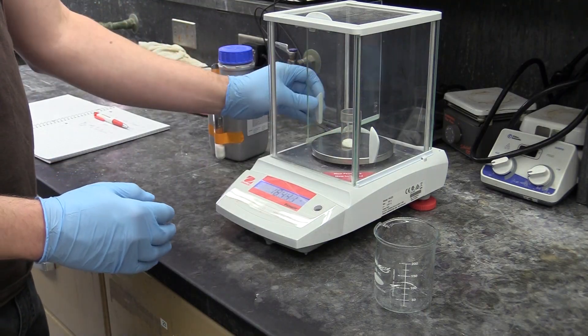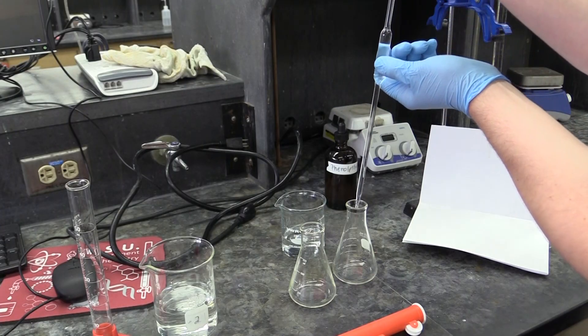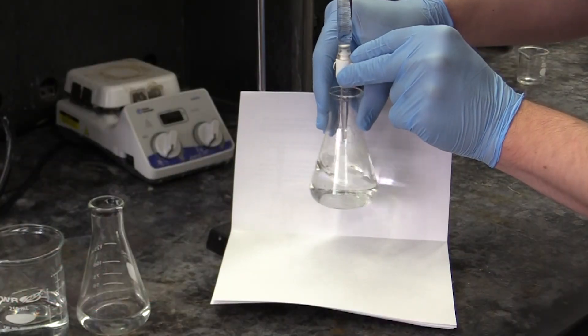You'll prepare and titrate your unknown acid solution the same way you titrated the oxalic acid solution. In your post lab, you'll use the data from these titrations to identify the unknown.